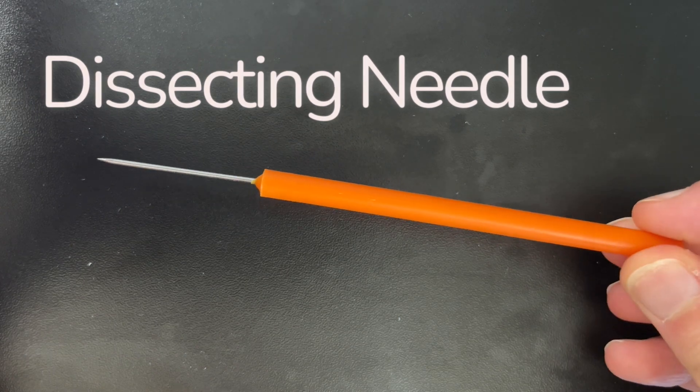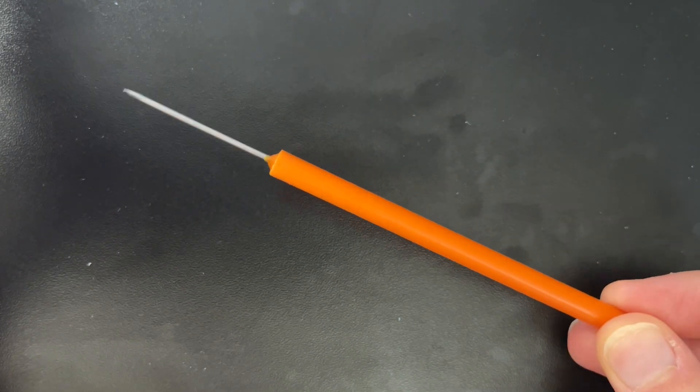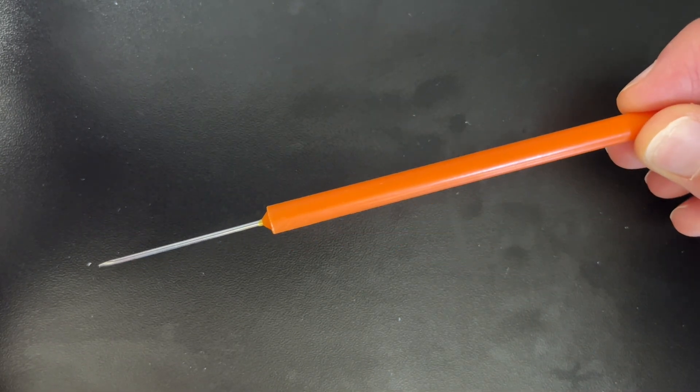Next up, we have our dissecting needle, also called a fine tipped probe or sharp probe. This is a sharp needle and it's used to help separate organs and to point at different things.